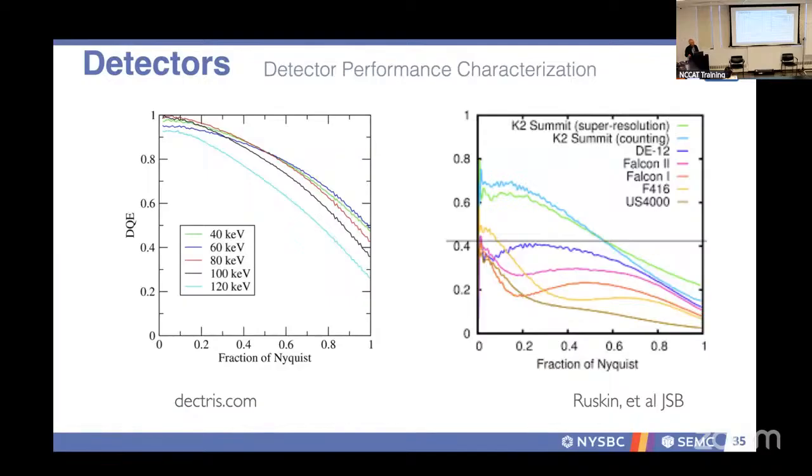So if you have more and more flux, depending on your frame rate, you have a situation where you can have coincidence loss. And what that would mean is that the readout of the detector might be too slow and you have more than one electron event hitting that pixel. Though the DQE of a sensor is always better on lower fluxes because you have less coincidence loss.